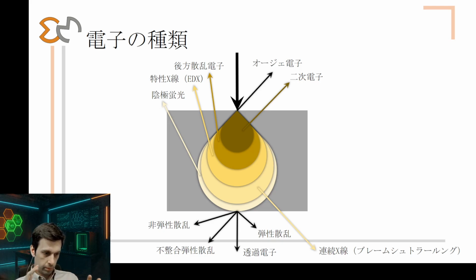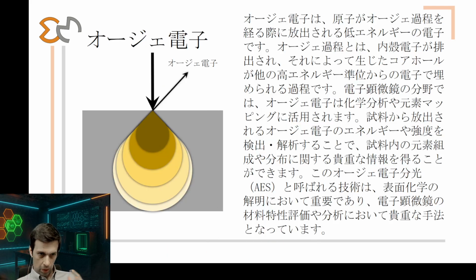Depending on the microscope and the detectors we use, we can collect specific types of information. We can obtain information about crystallography, composition, morphology, topography. So it's a versatile technique. One microscope with different detectors can obtain many types of different information. And I will just briefly speak about the main kinds.